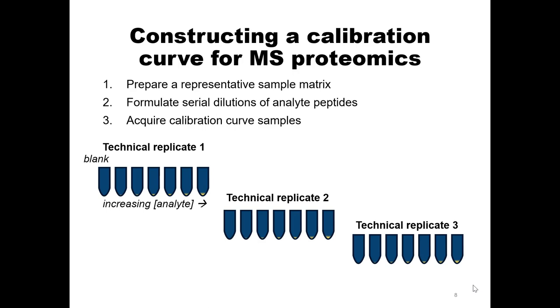Do you ever stack the points closer to the end of the spectrum than you would expect the majority of your samples to be? Oh, for sure. You might do a whole magnitude at the top end, and then space them more closely together as you think you're getting closer to the LOD, LOQ. I'll talk a little bit about how some methods for analyzing curves rely on that for determining what the LOD, LOQ is. Other methods are less brittle to that and are more forgiving for capturing the inflection point, even if you don't have a ton of samples drawn from that elbow of the curve.